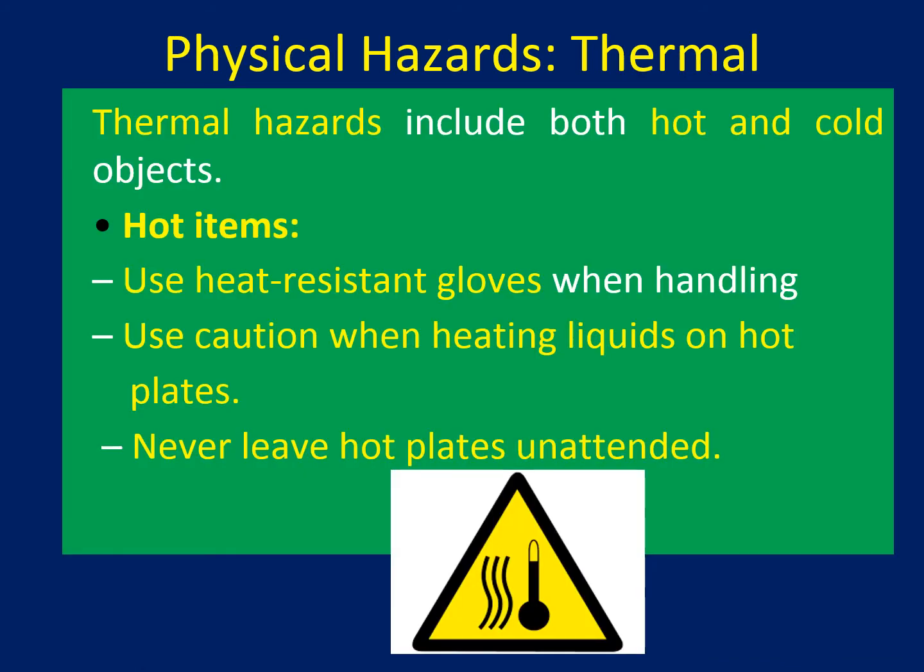Thermal hazards, right? I think most of you are familiar with thermal hazards, because you have started with research and you can see hot and cold objects. Most students think that only hot items cause injuries to our hands or body, but keep in mind that cold items can also cause injuries to the body.